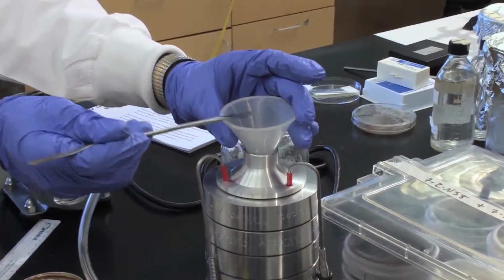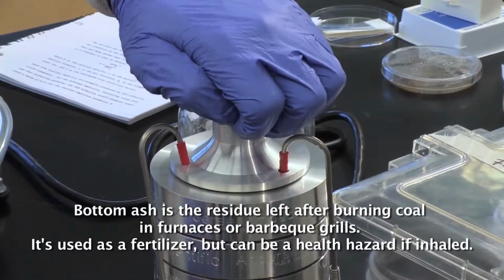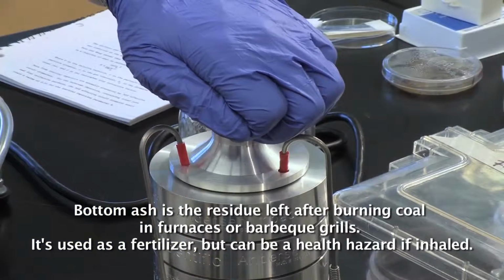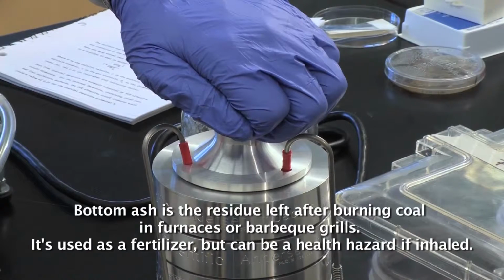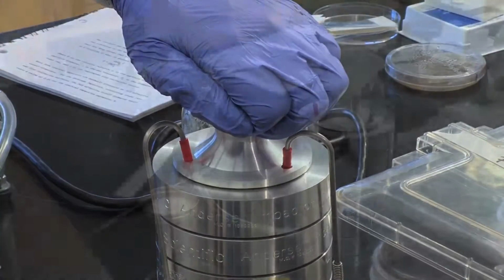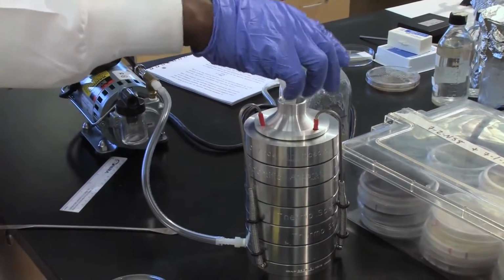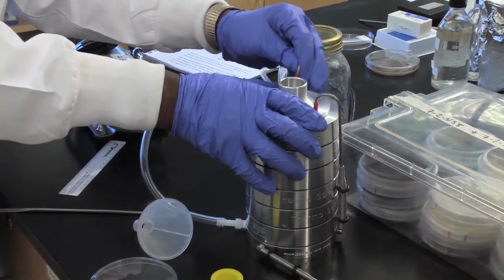So I'm going to tap it over, and typically it will be good to close it to create more of a suction. So we'll let it run for about 3-5 minutes, but you can go longer. We've gone through this for a few minutes, so let's disassemble it and see what we got below it.